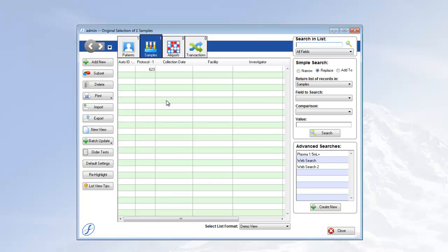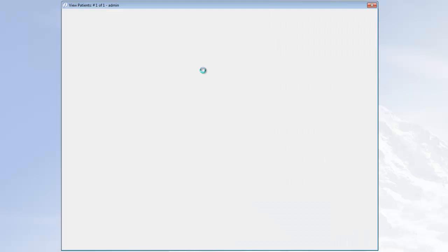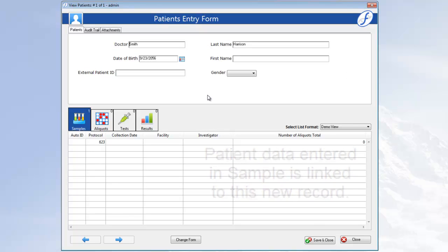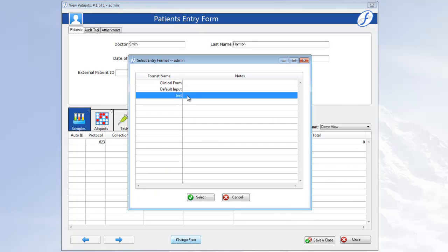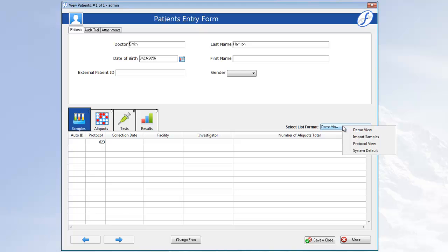Now, let's go to the Patients page and find the patient we just created and linked. If necessary, change the form to the one with the Patients fields that were on your samples form. The patient data we entered in the sample is here as well, and in the bottom section we can see the lone linked sample. We can use the list format drop down to pick a preferred samples list view.